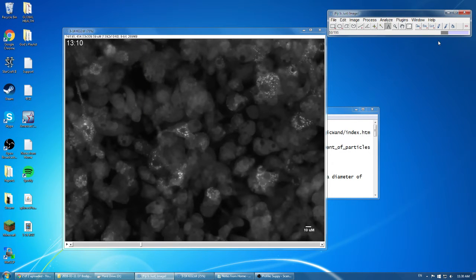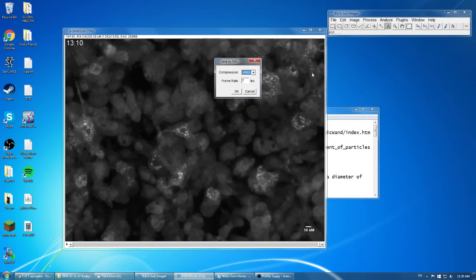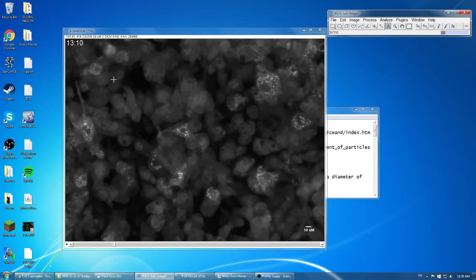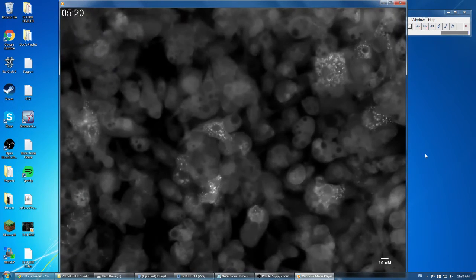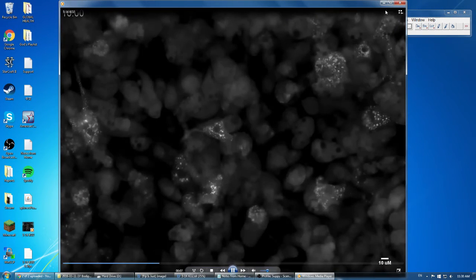And you can see on the top right, it's taking some time to process it and save it. And we're also going to save one as 1.5 frames per second. So save as AVI, 1.5 frames per second. And you'll just see the difference. If we take a look at the first movie, which is already finished, here it is at 7 frames per second. And this is just something you can play in your PowerPoint without having to touch it.